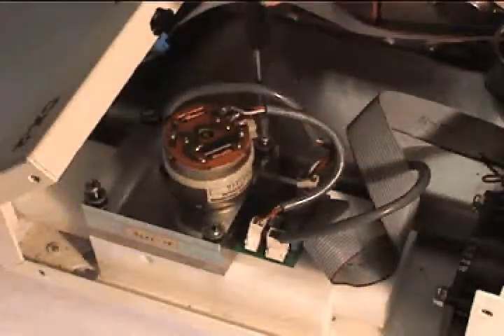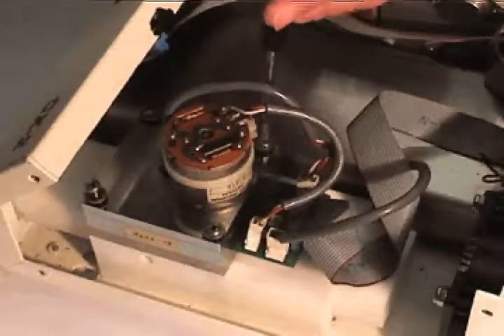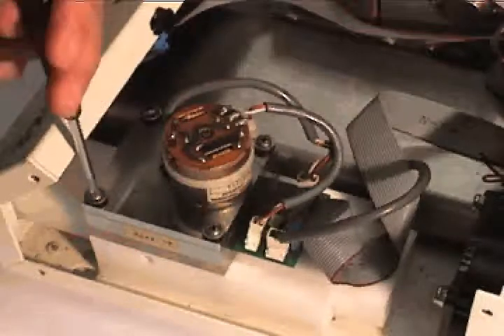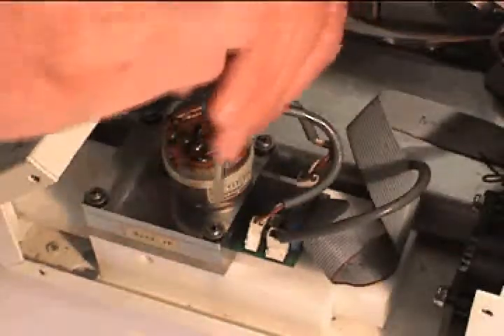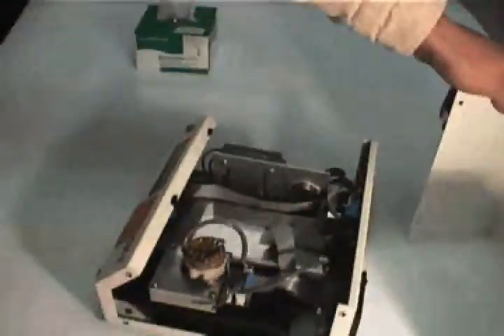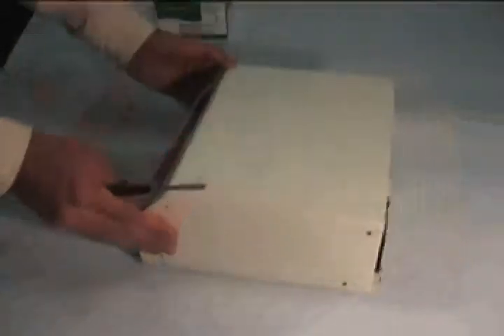If the drawer slide sticks, then you have over-tightened the screws. When you are finished, replace the lid and all eight screws. You are now ready to verify the calibration.